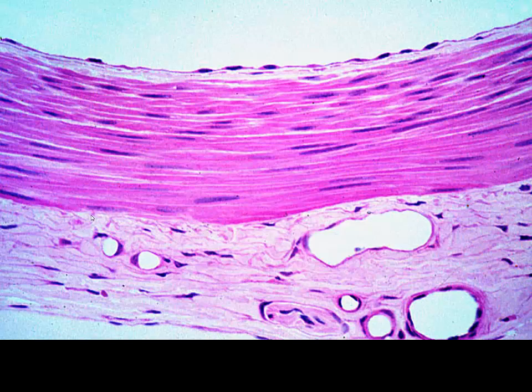Looking a little bit closer, again, we can fairly easily identify the endothelium. So if I ask you to identify these cells, you would say endothelium. See, we're moving away from the classification of simple squamous epithelium. Now we're going to identify them. Here we have subendothelial compartment, and that's still, remember, part of our tunica intima.